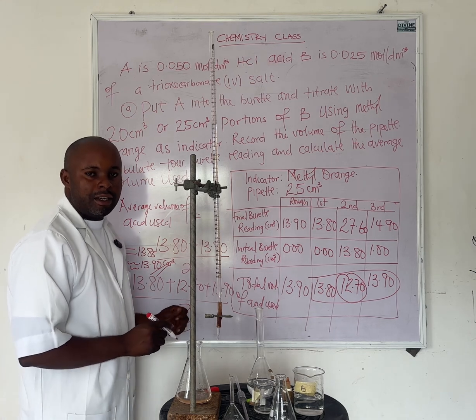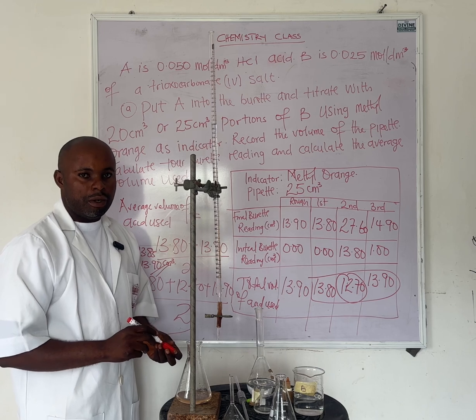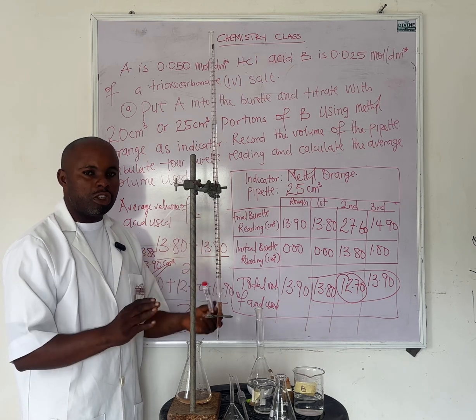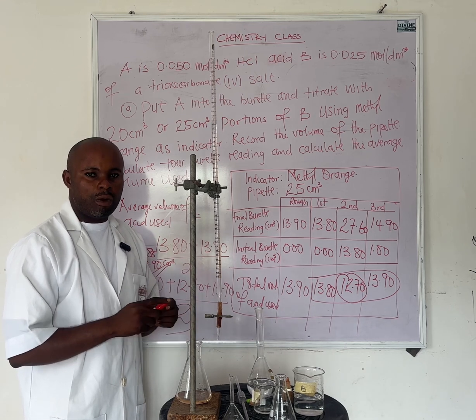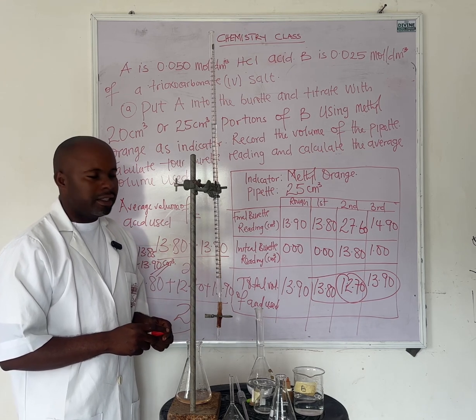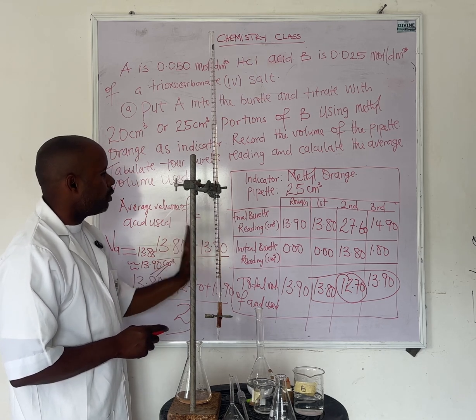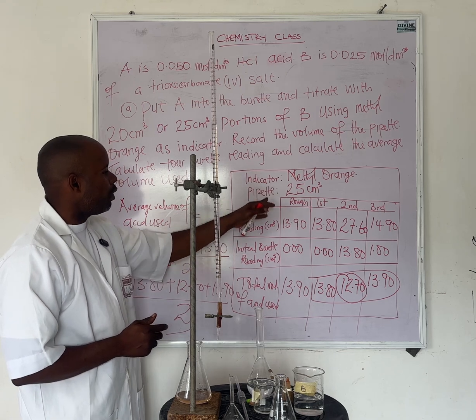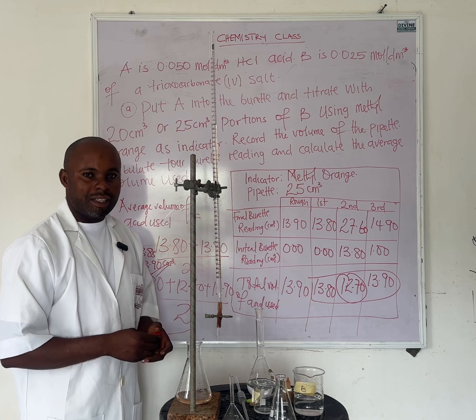So in this titration, this is my VA. As I've said, this demonstration does not actually reflect the titer value of my center, neither of any center. This procedure is just to guide you on how to carry out titration in a normal chemistry lab. This is a simple method for you to run this titration using a specific indicator and pipette. So in this regard, this will be the end of this lesson.